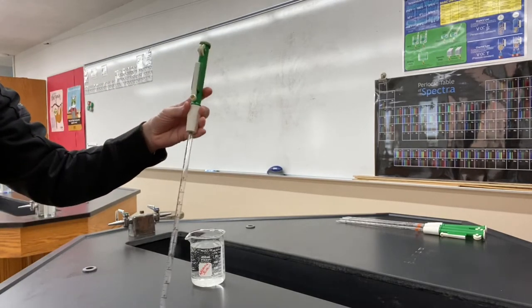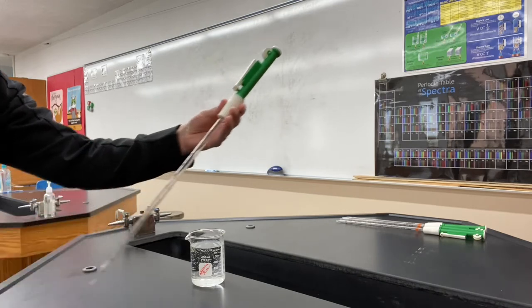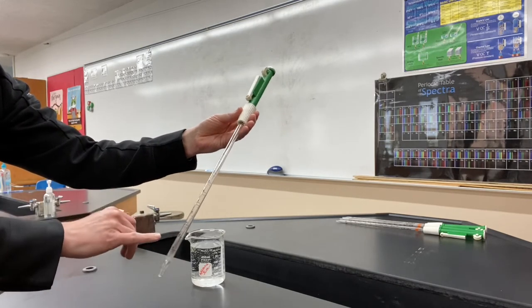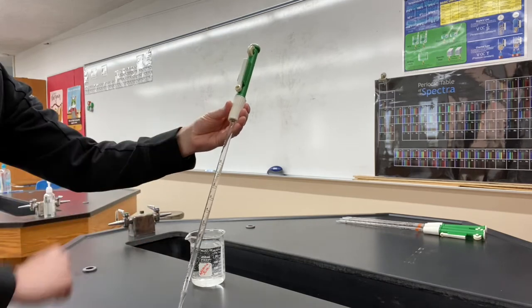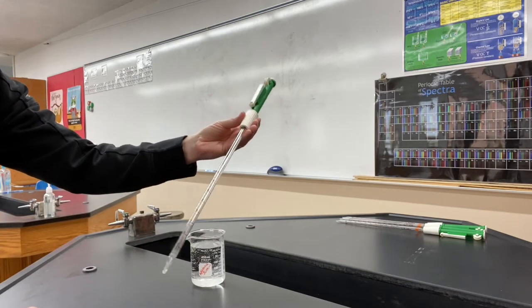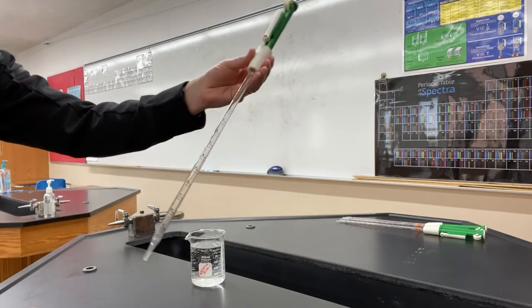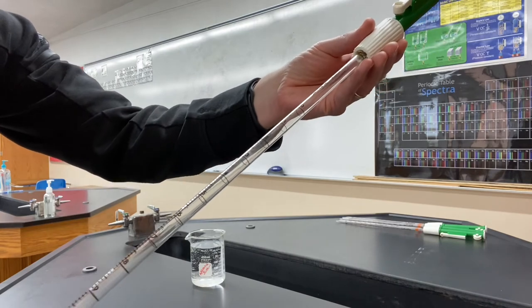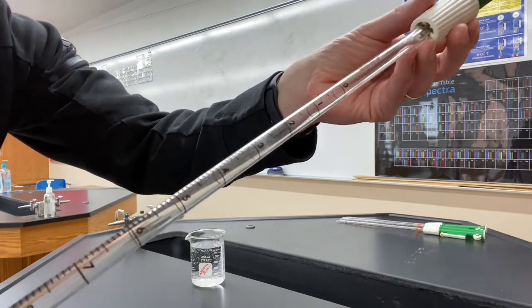So I wanted to record a video on how to use one of these devices. The glass piece is called a pipette, and this is called a pipette pump. And this is a good device if you need to make a very accurate volume measurement. So this is marked off in milliliters. I'll bring it in a little closer here.